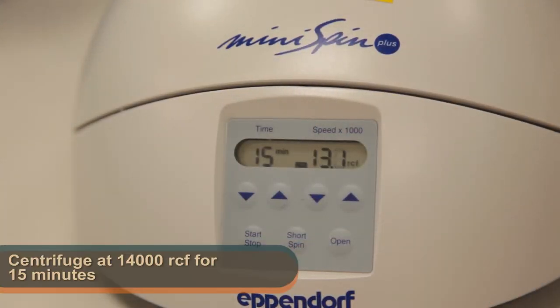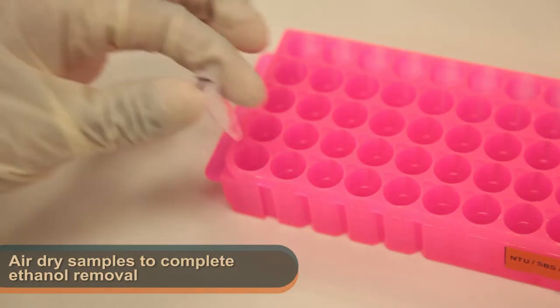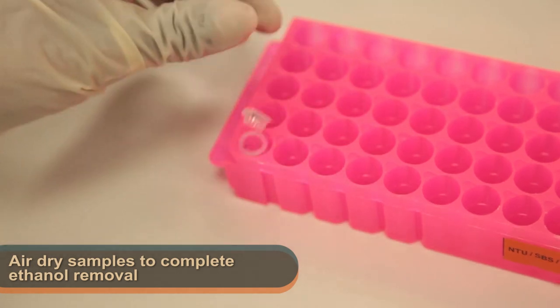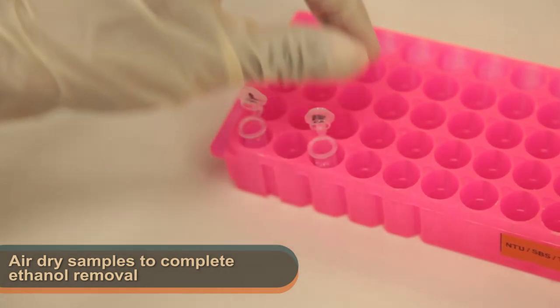Next, centrifuge the samples at maximum speed for 15 minutes and then remove the supernatant. Air dry the samples as follows to complete the ethanol removal. Do take note not to over dry the sample pellet.